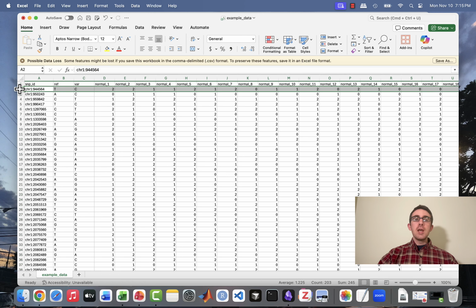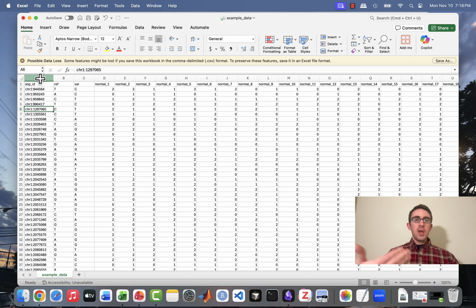is a different SNP. Again, at this point I'm just repeating stuff that hopefully you already know from the previous video. For each SNP, the first 3 columns tell us some info about the SNP.